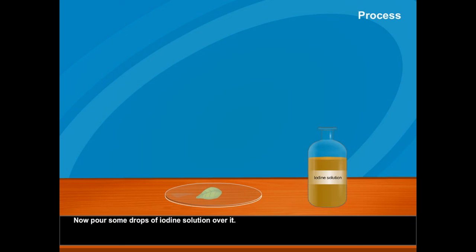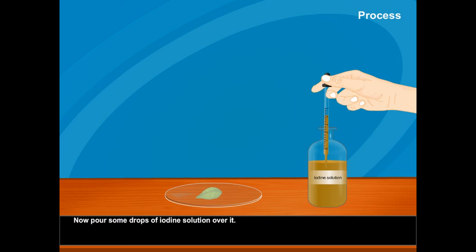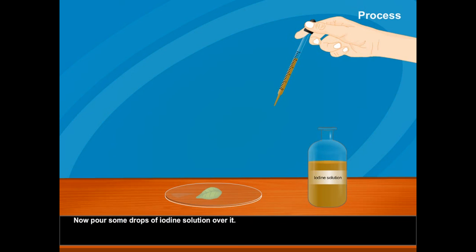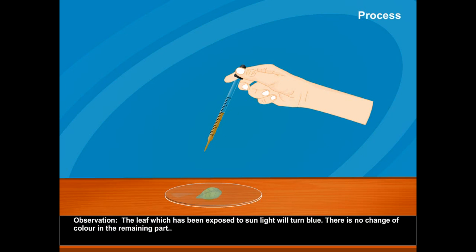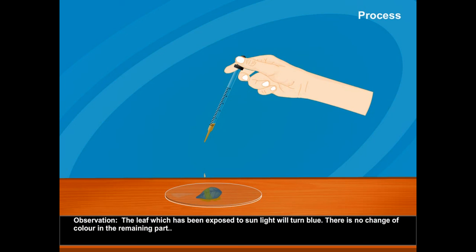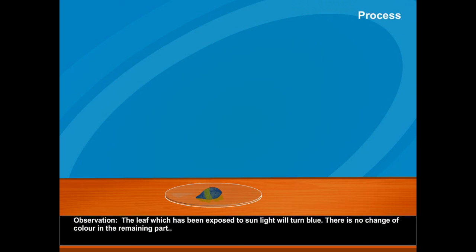Now pour some drops of iodine solution over it. Observation: The leaf which has been exposed to sunlight will turn blue. There is no change of color in the remaining part.